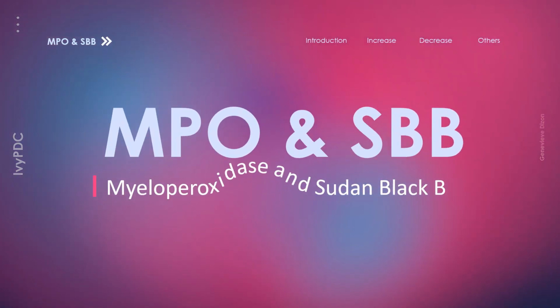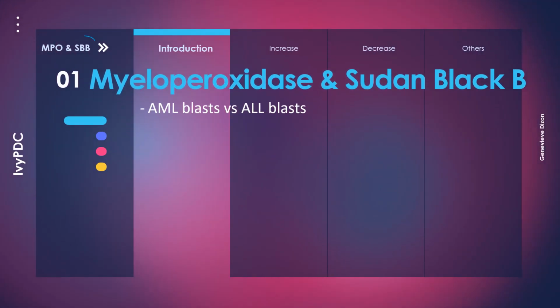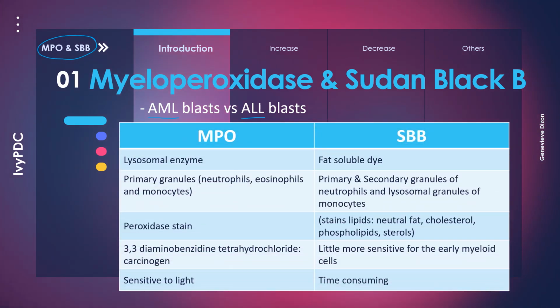The next set of stains to be discussed would be myeloperoxidase, or MPO, and Sudan black B, or SBB. In general, both MPO and SBB may be used to differentiate acute myeloid leukemia from acute lymphocytic leukemia. But to differentiate these two, MPO, or myeloperoxidase, is an enzyme, a lysosomal enzyme that is found in the primary granules of granulocytic cells like neutrophils and eosinophils, and sometimes up to a certain extent may even be found in monocytes. SBB, on the other hand, is a dye.